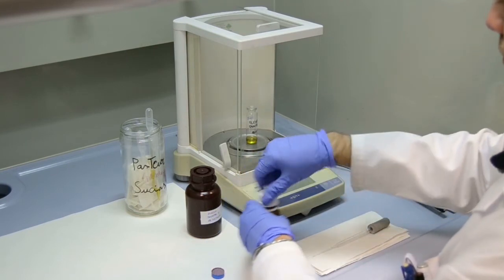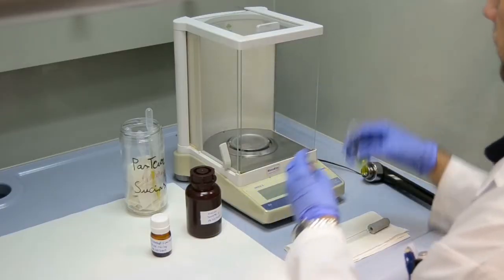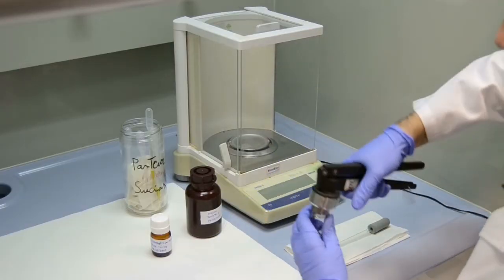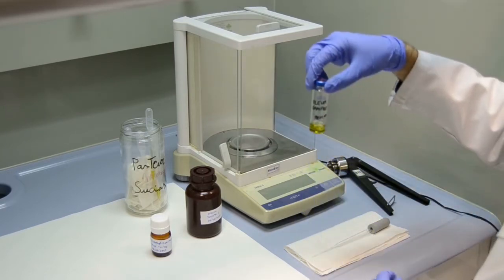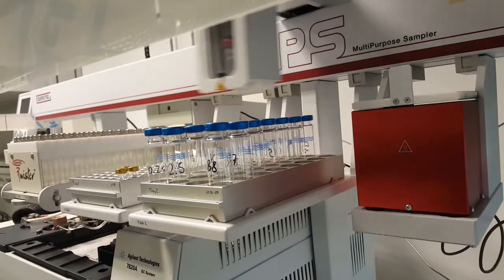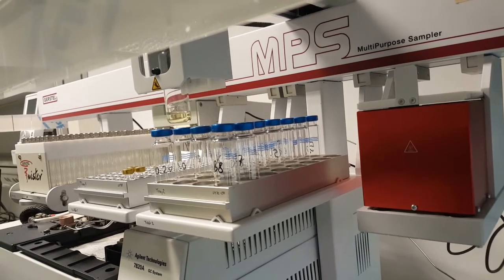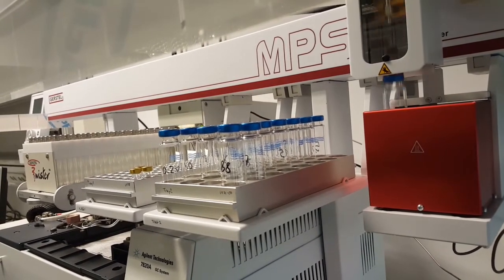In general terms, a rapid preparation is advisable to avoid evaporation of volatiles. Thus, it is advisable to close the vials after use. At the end, close the vials with the septum and cap and shake it gently and softly. An autosampler makes the analysis easier, although the same sampling and injection can be carried out manually.